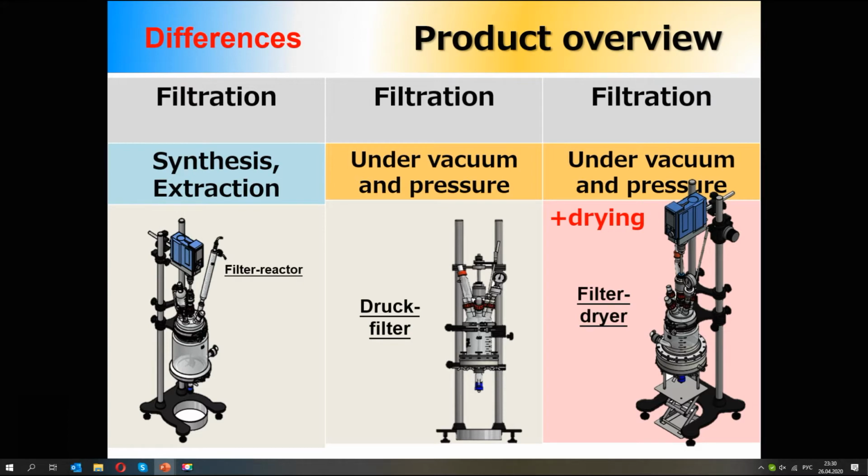In general, it is called the filter reactor, and as it is called the filter reactor, it is expected to be something to do the reaction, the synthesis of something. But apart from the synthesis, which can obviously be done in this filter reactor, we can also do the filtration, and we can also do the extraction, which are very important and very popular processes that are done in the labs.